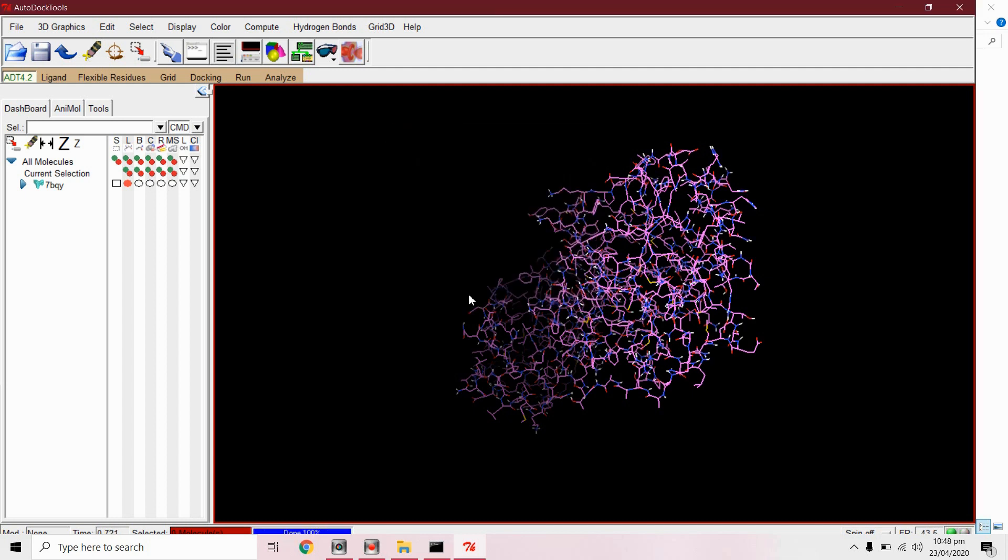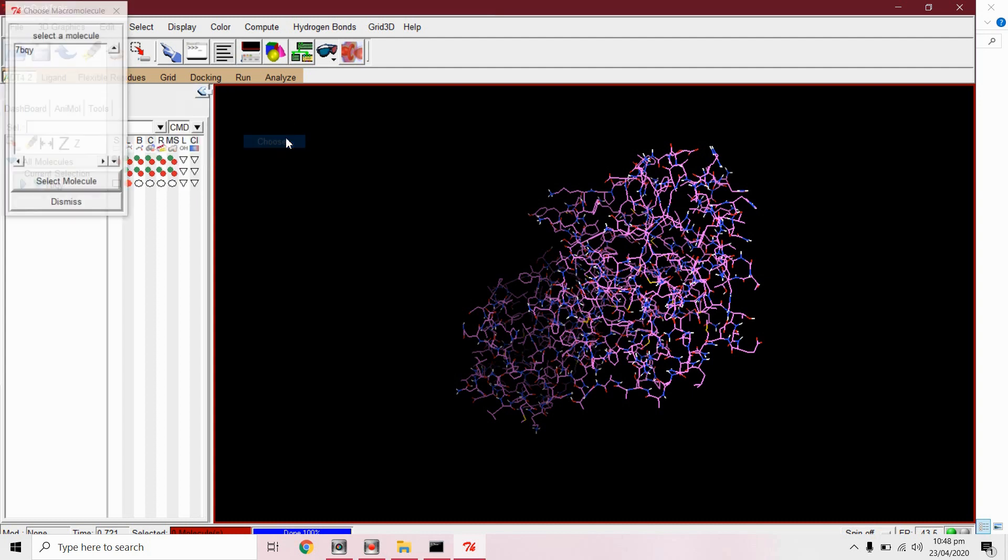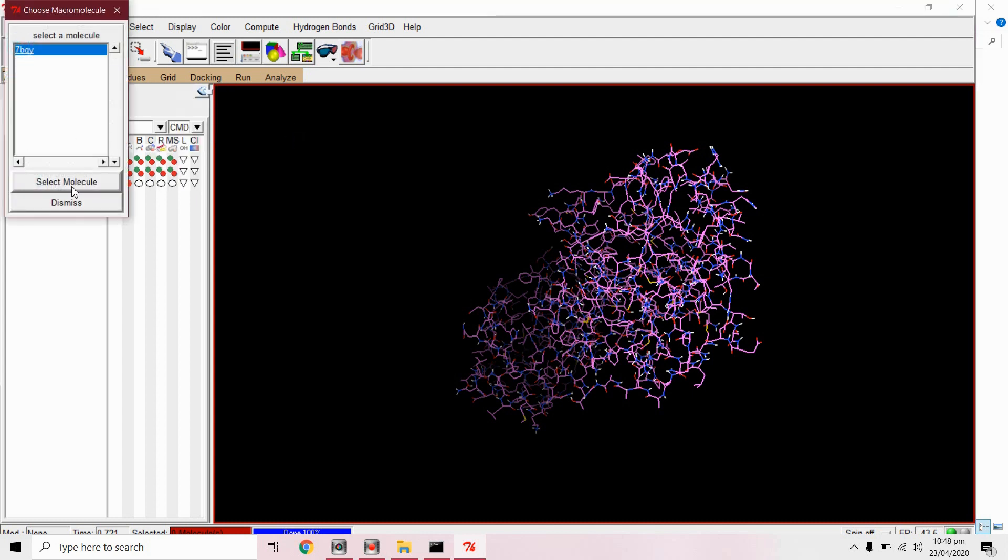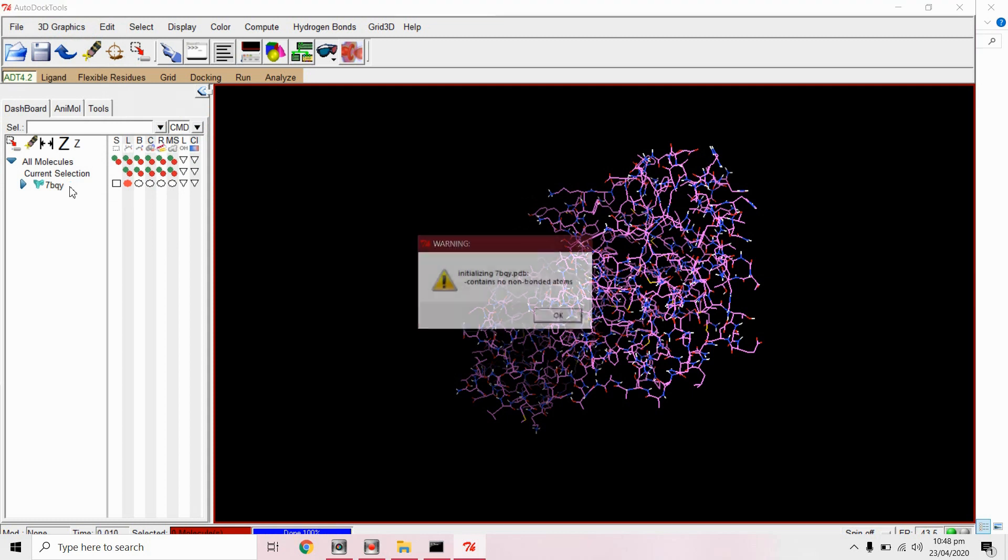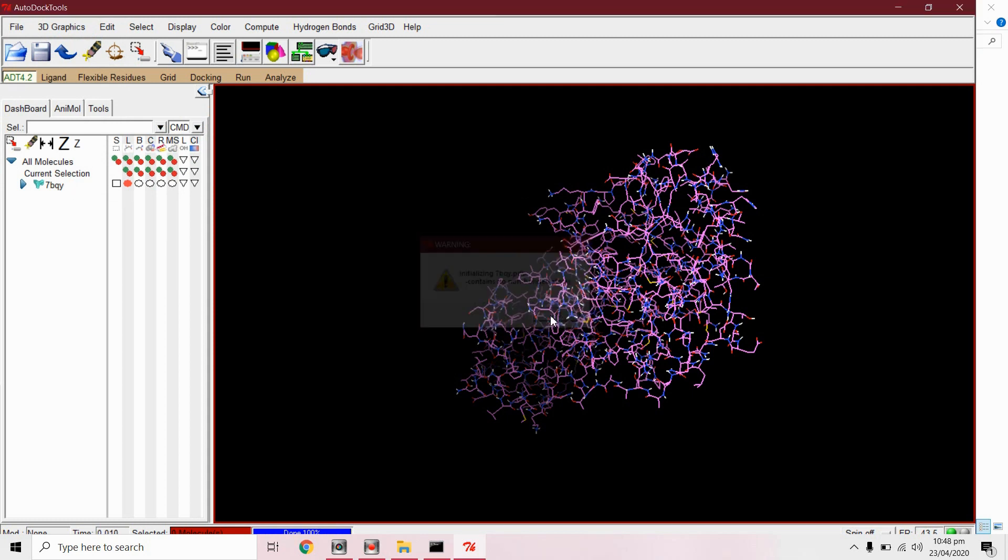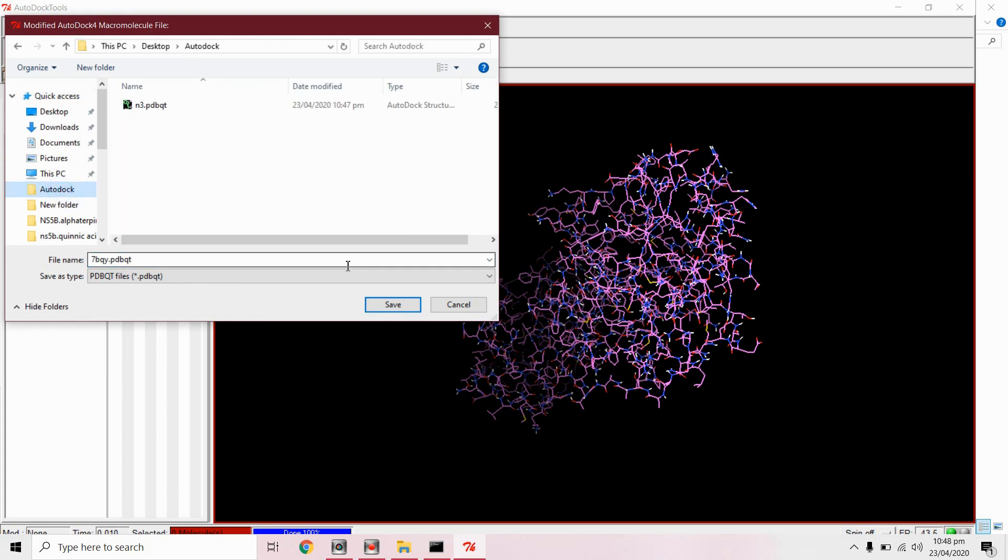From grid macromolecule choose this molecule select molecule. Now we will save this protein in dot PDBQT format.